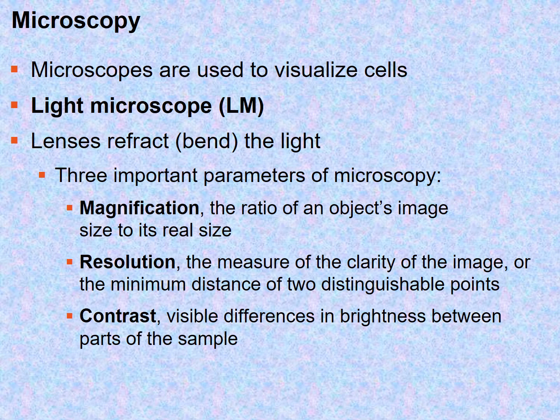The light microscope, or LM for short, is basically made up so that there is a light source and it's passed through the specimen. And when light goes through a specimen, the light kind of disperses, right? And you see kind of shadows. When the light disperses, that is called refraction. Okay, so the light is bending on the edges of the main parts of the specimen, and this allows the specimen to be seen under magnification.